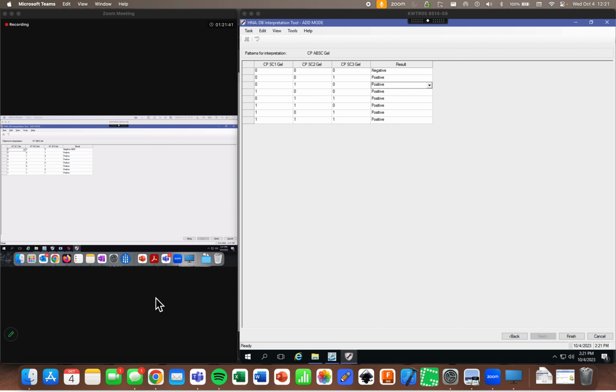Correct. Yep. So here we're actually seeing the alphas that we associated to each one of the DTAs. Well, actually, we're seeing them associated to the hashes, and then we're seeing the hashes back over here. But the results, yes, those are what are connected to that ABSC interpretation assay that we did in Bedrock. Yep.